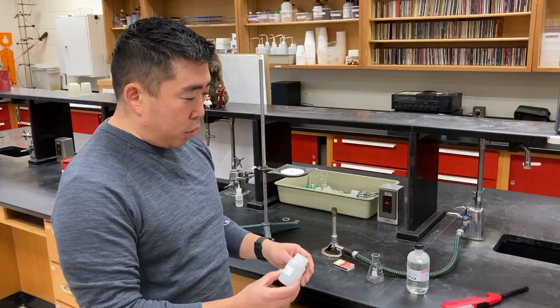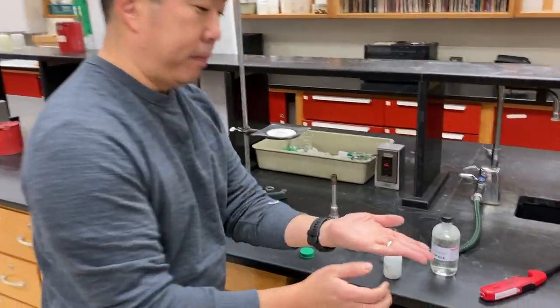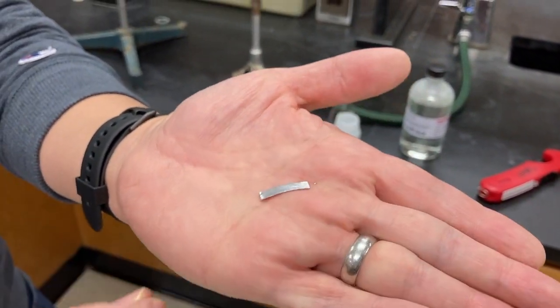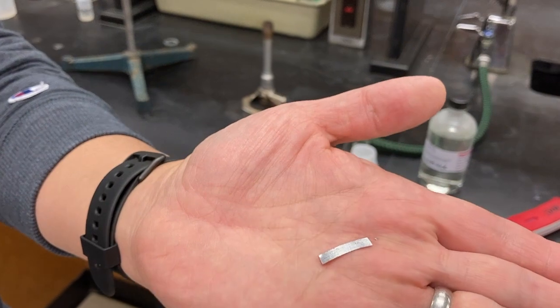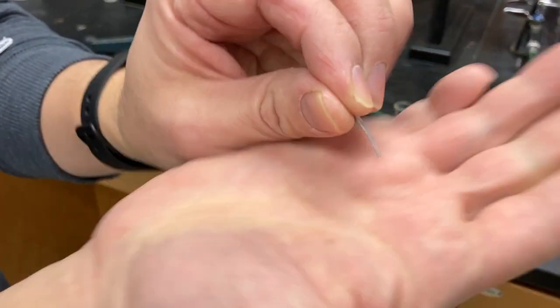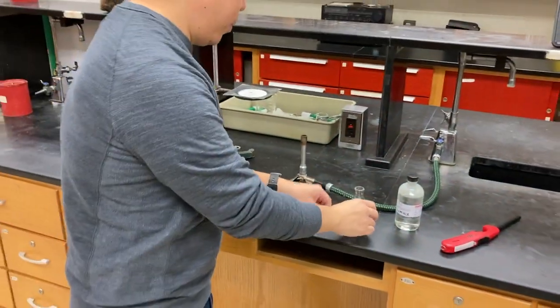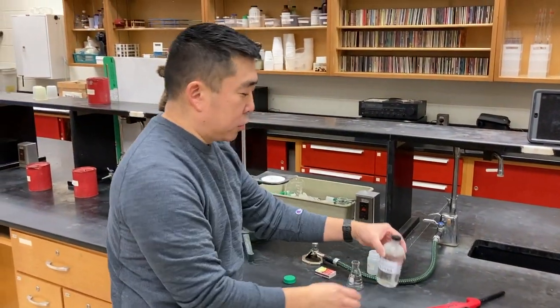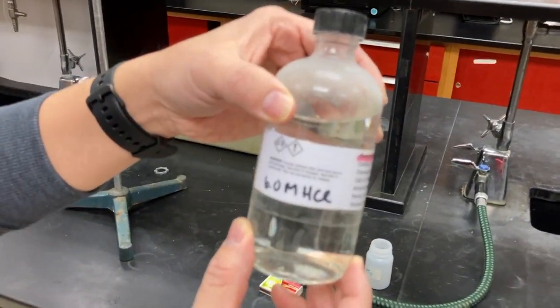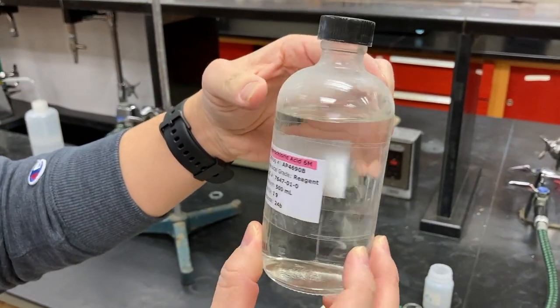All right, so today we're going to react magnesium, which is a shiny metal. Now that's the metal strip in your hand, not the ring around your finger. Sorry. Got it. Okay, we've seen that before. And so it's going to undergo a reaction with hydrochloric acid, a clear, colorless liquid. We actually saw that in one of our previous labs. That's right. It reacts with metals.